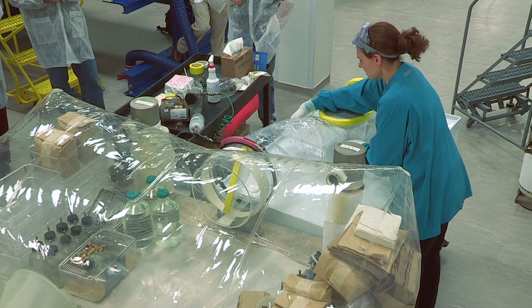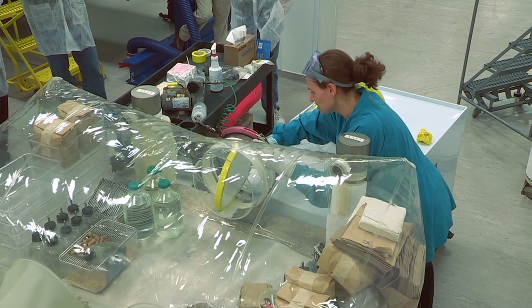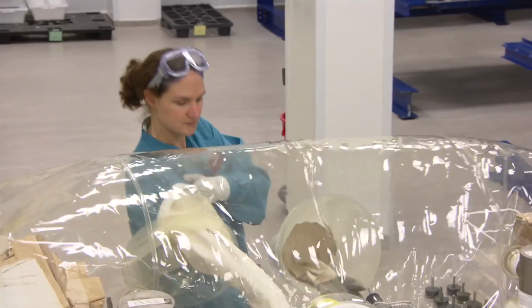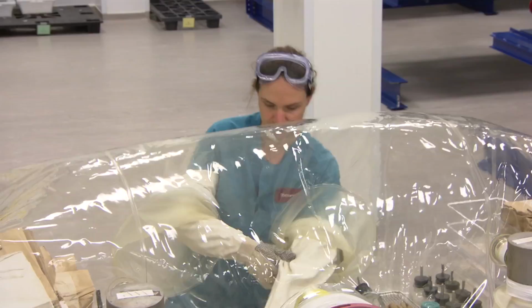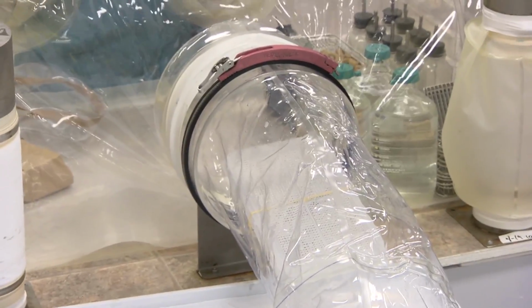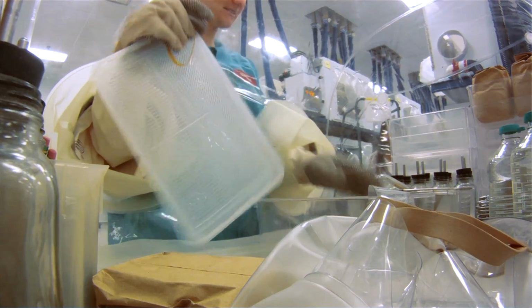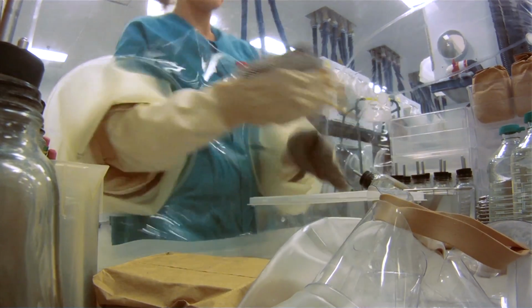And then when you're ready to send your animals in, you can just slide the cages around. And this will have already been, let's see if I can push it out of the way, already in your isolator. Slide our cage up. Pull this in. Bring in our animals, and then we can just unpack our animals and get them placed into cages, and we're ready to go. And then all of this, we just exit back out of the isolator.